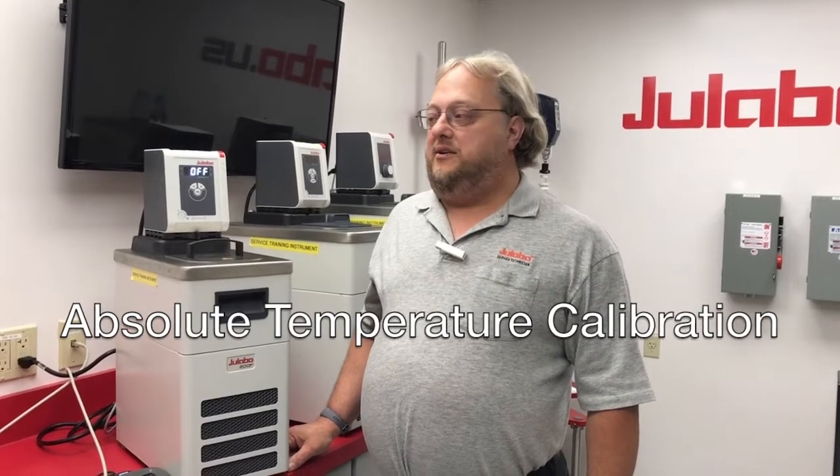Hi, I'm Nelson Hill, Electronic Service Team Leader here at Julabo USA. Today we're going to go over how to perform an ATC or absolute temperature calibration on your Corio CD circulator.